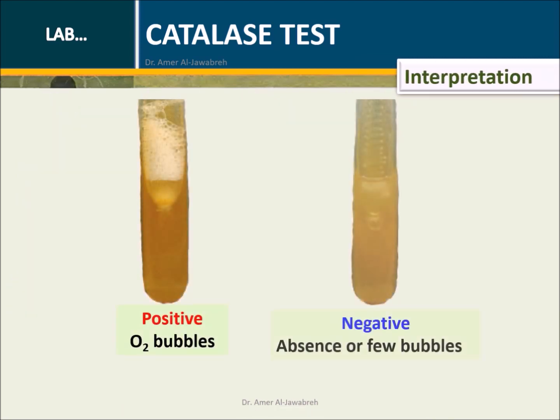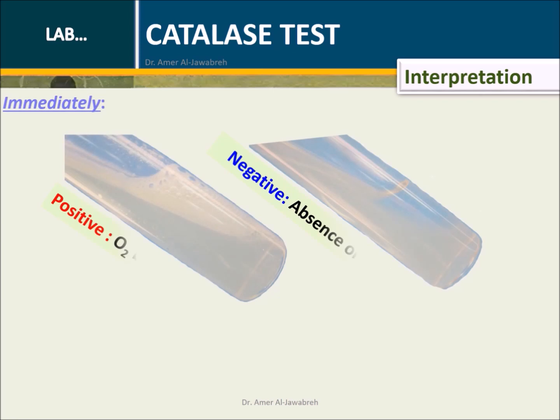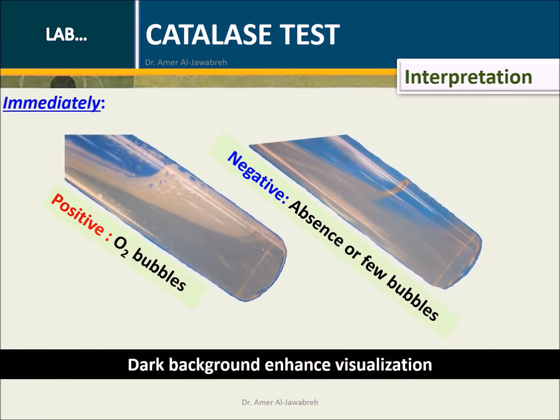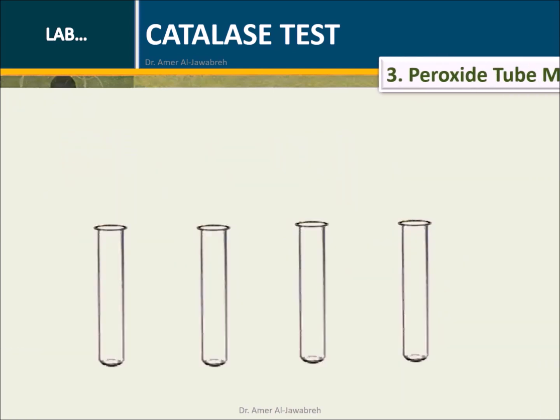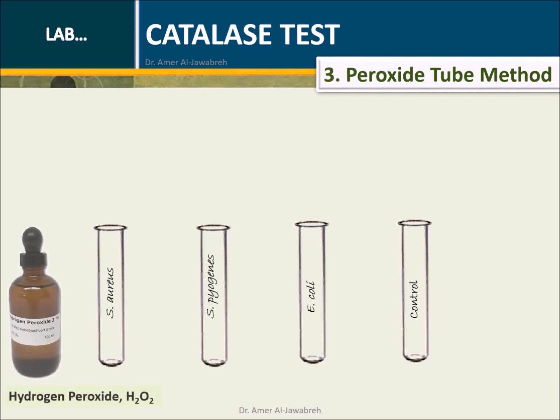Interpretation: Oxygen bubbles indicate positive results; absence or few bubbles indicates negative results. Dark background enhances visualization. Next: the peroxide tube method.